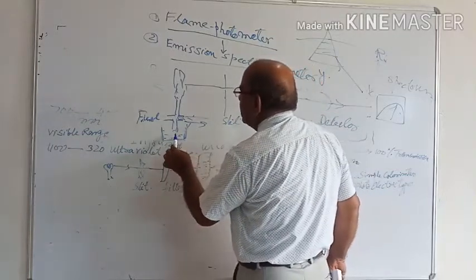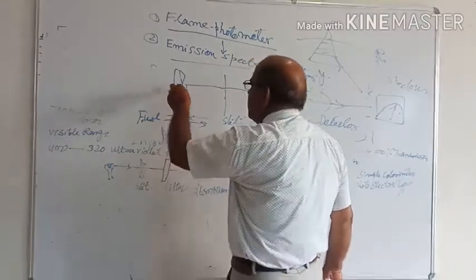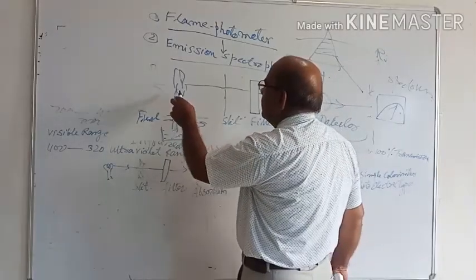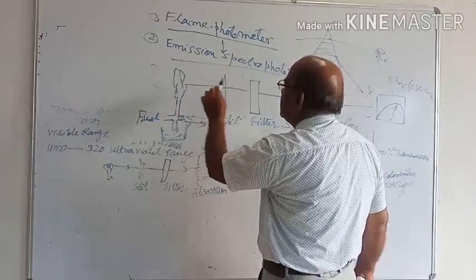After pressing the air, this solution goes up in the flame, and the atoms contained in the solution are excited, and they generate the spectrum.